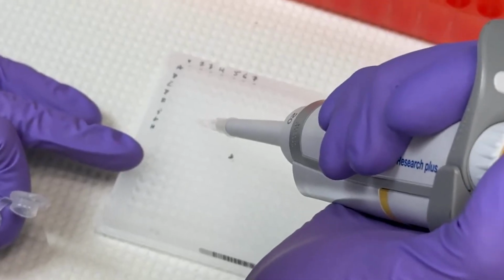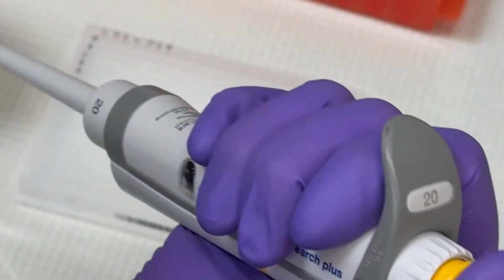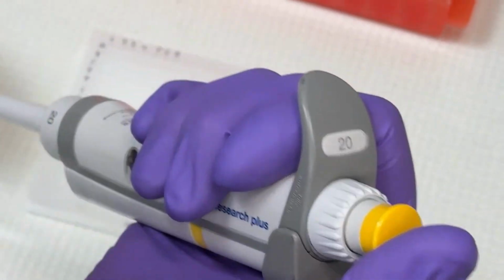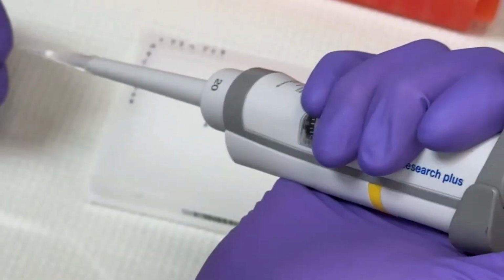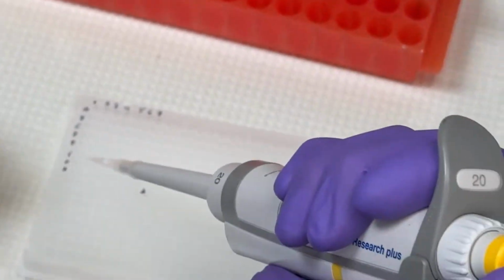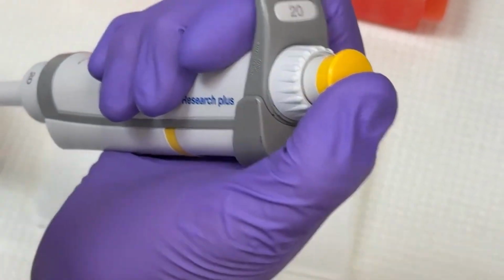If you're pipetting and your tip touches something, you lose track of where the tip is, and you happen to touch that on something, go ahead and discard it and use another one. There's plenty more tips here, and it's not worth having to repeat a whole experiment to save the money on one little tip. So we're almost done with the 18S addition to the plate. And then I will move on with the TERT.